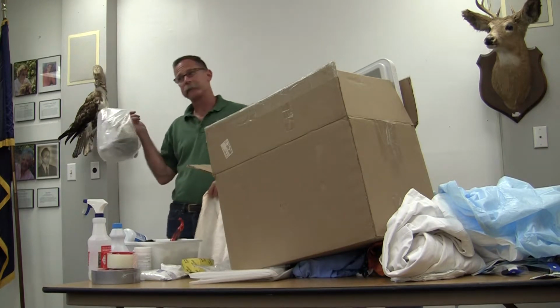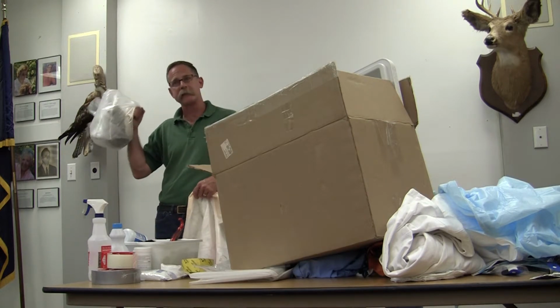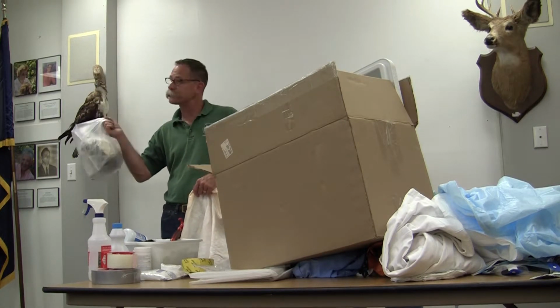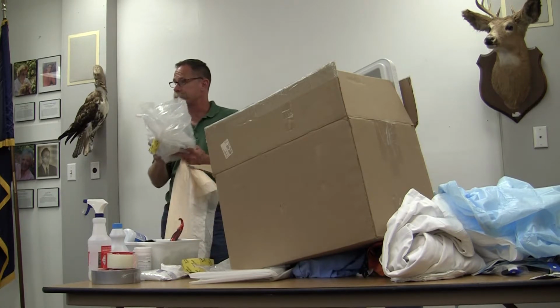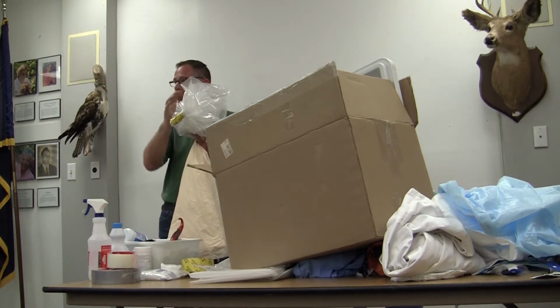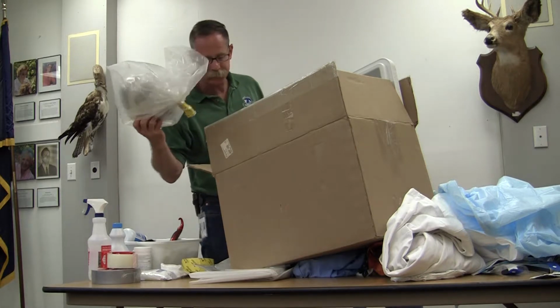When I order these bags, I order them from Zeke down at All American Poly, and I tell him the size and the mil, and then I specify leak proof. And he goes, yeah, okay, leak proof. And you know he's just laughing at me because there's no such thing as a leak proof bag. Especially if you put something in the freezer, it gets a little brittle. You've got little toenails and talons and beaks poking through. So eventually all bags are going to leak. So you want to keep that in mind.